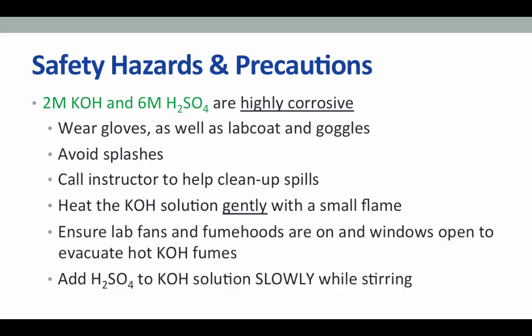In the event there is a spill, call the instructor over, as there are special supplies in the classroom for cleaning up these types of spills. Do not simply use paper towels.